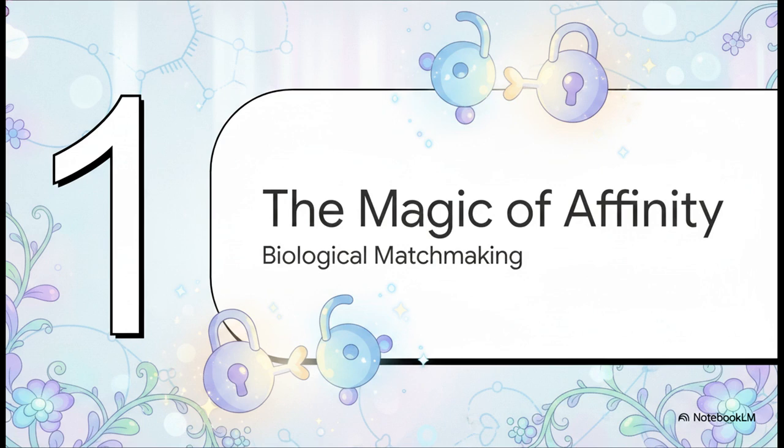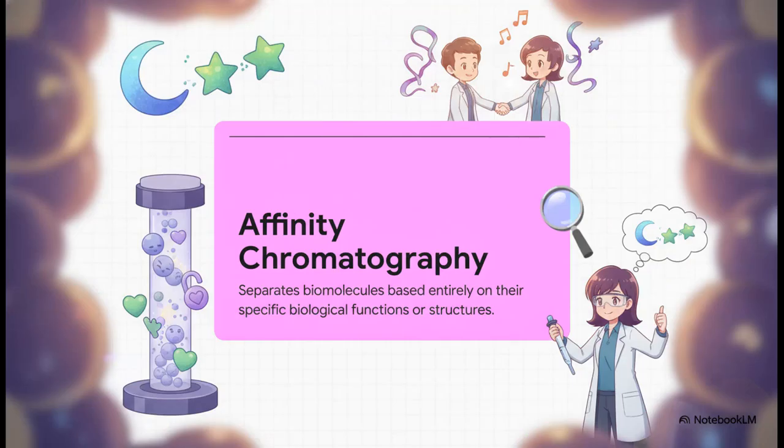The magic of affinity. So, affinity chromatography. It's a highly selective separation technique, but, unlike standard methods you might be used to like gel filtration or ion exchange, which sort things out based on just physical size, charge, or polarity, this is a whole different ballgame. It separates biomolecules based entirely on their specific biological functions or individual chemical structures. It relies completely on biological matchmaking.